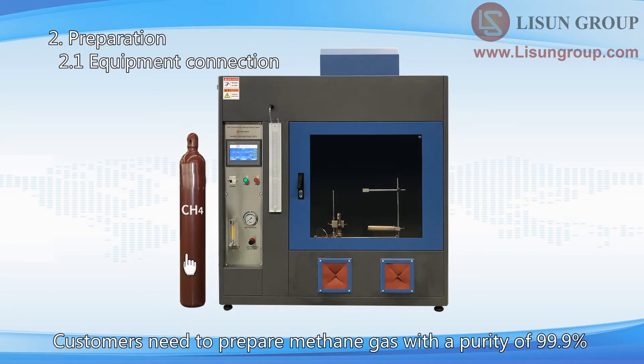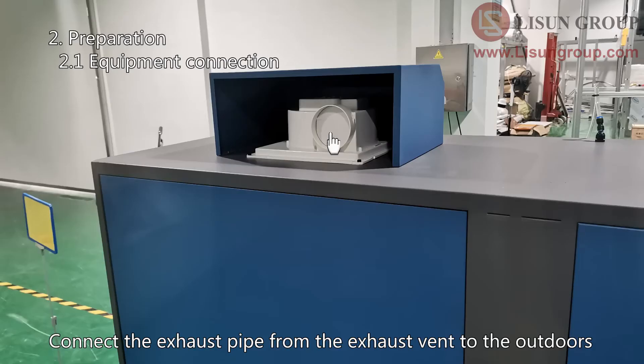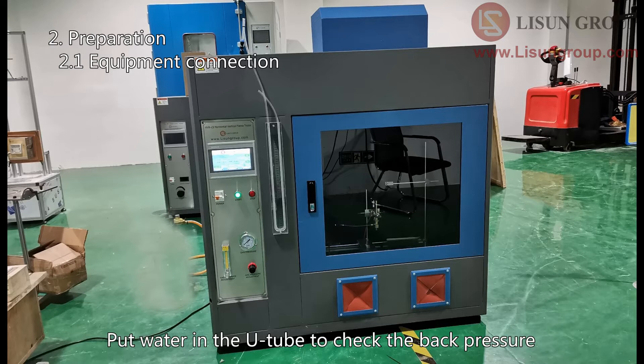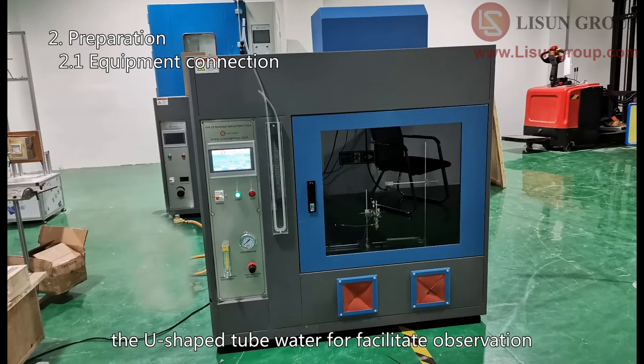Customers need to prepare methane gas with a purity of 99.9%. Connect the gas to the equipment. Connect the exhaust pipe from the exhaust vent to the outdoors. Put water in the U-tube to check the back pressure. A small amount of potassium permanganate can be placed in the U-tube water to facilitate observation.